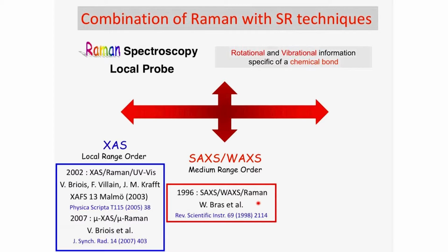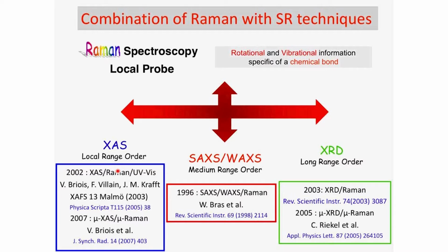Now, about 10 years ago, my group was among the first groups combining X-ray absorption spectroscopy with Raman spectroscopy. And more or less concomitantly, colleagues from Brookhaven, I guess, and colleagues from the European Synchrotron Radiation Facility combined the X-ray diffraction technique with Raman spectroscopy.